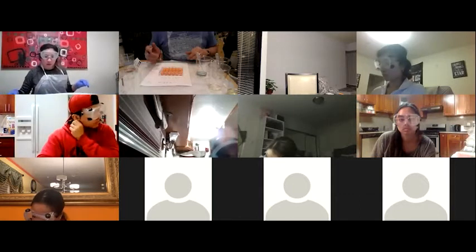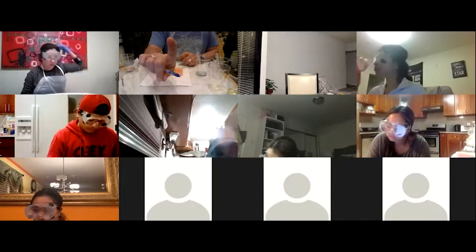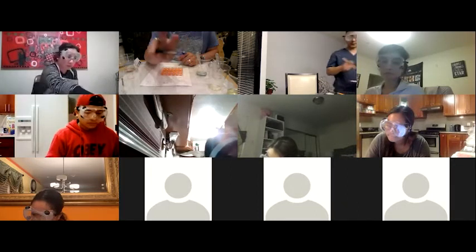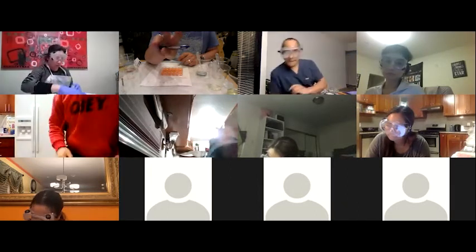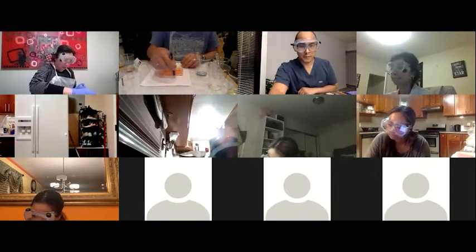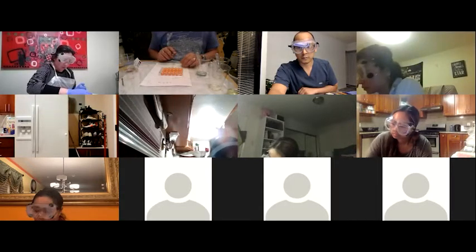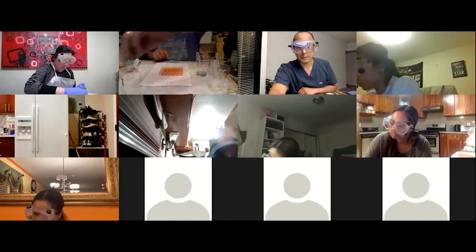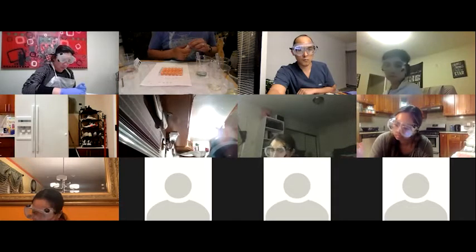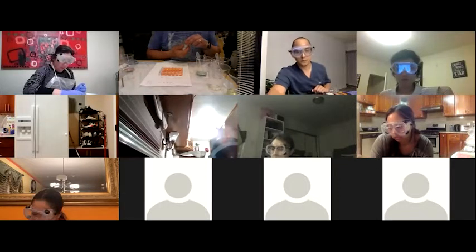For my dilutions, I want to have 1 drop of the 0.1 sodium hydroxide in the first row, 2 in the second, 3 in the third, 4 in the fourth, 5 in the fifth. Just to be sure, write it right on top. That way I will not forget. The more things you can do to idiot-proof a lab, the better. And believe me, I've idiot-proofed many in my day.